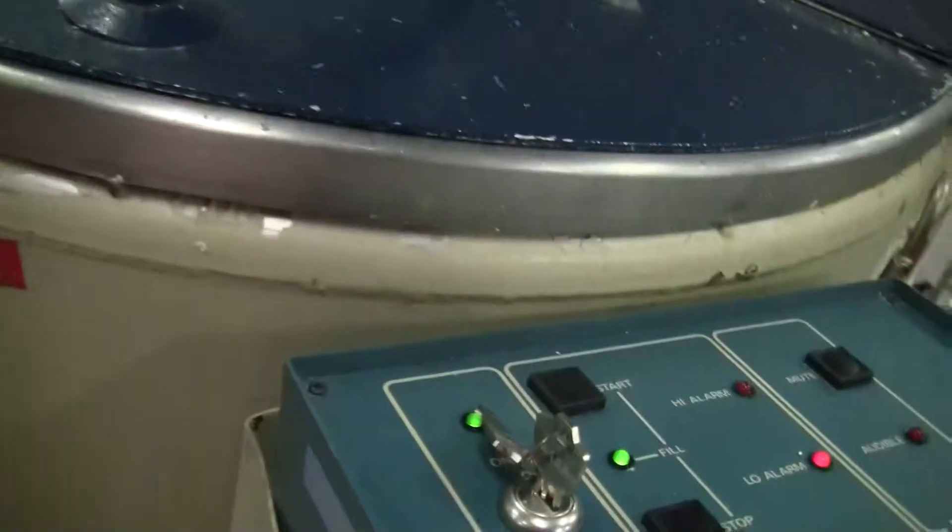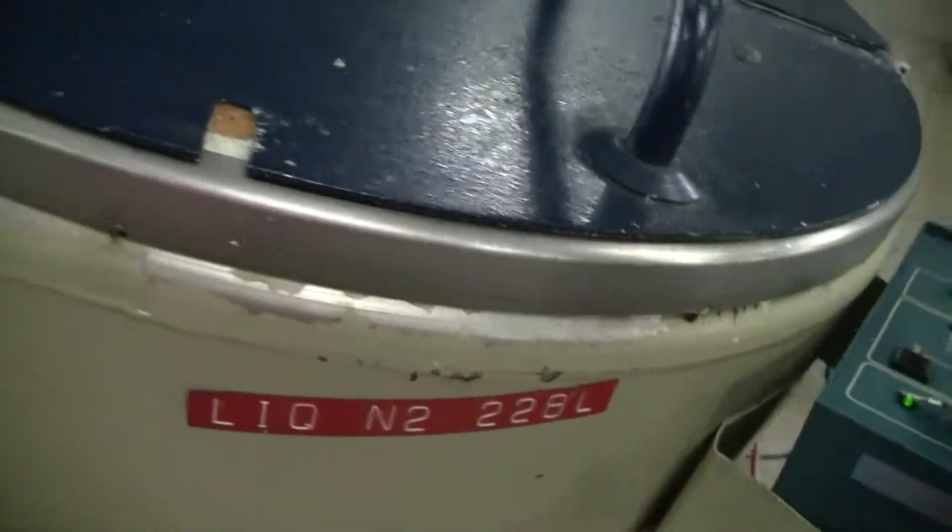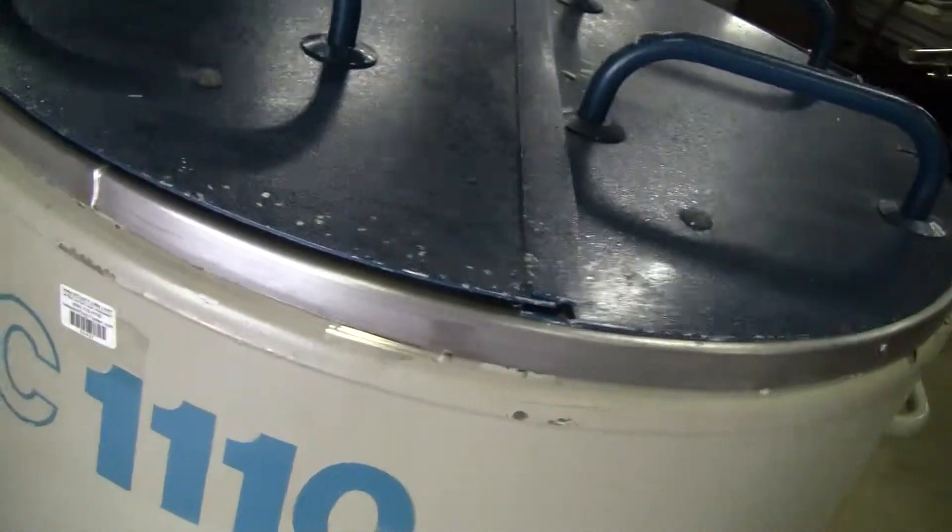Let's take a look inside. Very clean inside. It does have some cosmetic paint issues on the outside, as you can see — on the top, down there, and along the bottom. Other than that, it's in great shape.